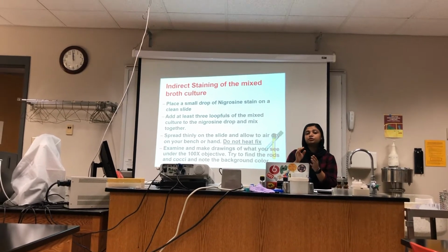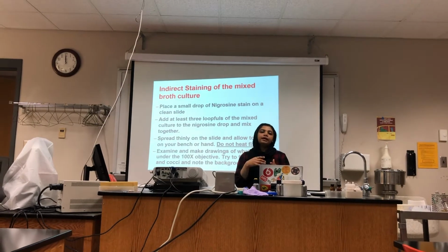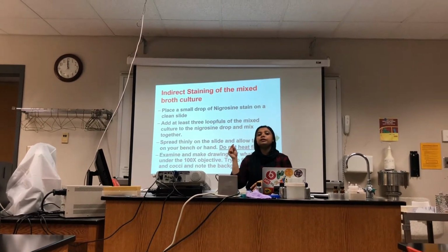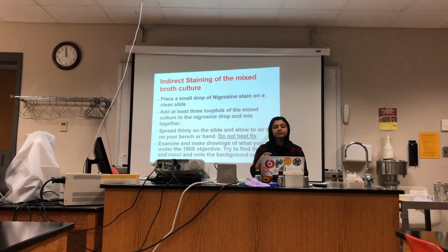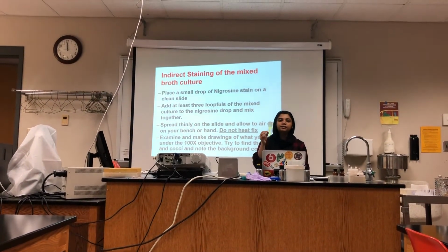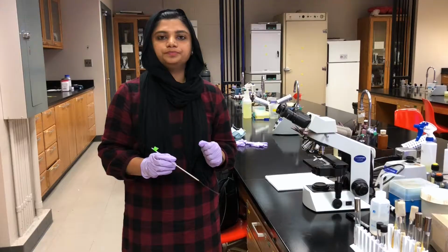You should be very careful to make a thin smear, and then allow it to air dry, and then we will view it under the microscope. We are using the 100x objective, which is an oil immersion objective. I'll be placing a drop of oil onto the slide and we'll be viewing that.